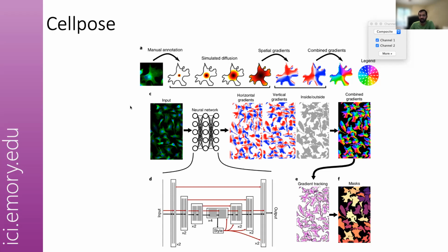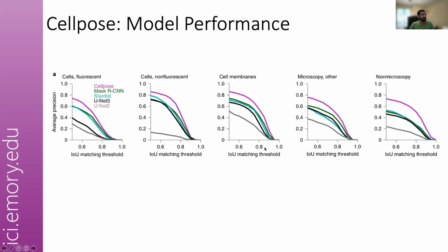So this group has utilized lots and lots of cells which were manually annotated and fed into the system. So based on these different shapes, anytime your image has any decent signal to noise ratio, or a pixel which is bright and a pixel which is dark, the model will try to predict whether or not there is a cell present over there. Okay, so that's essentially what Cellpose is trying to do.